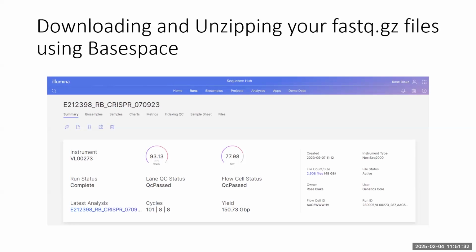Yeah, so essentially you download your sequence. It can take a while because they're really big files. You unzip them, and then you match the sequencing to the guide library. In the cloud folder, I think there's a folder called sequence analysis. In there, there's the pipeline that Nick has developed, and it's run on Spyder, which is one of the Python formats. And there's instructions in there as well on how to download Spyder.